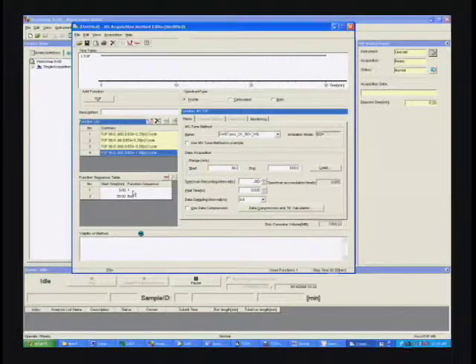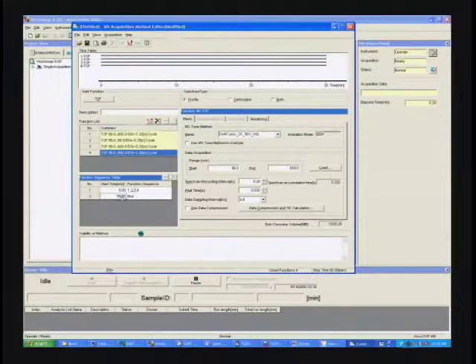Alright, the next thing we'll do is we'll set up our sequence table. We need to have it run all 4 of the functions. And we have a stop time here of 30 minutes, which would be an overall stop time, but we can stop the functions from collecting data during our acquisition whenever we're finished collecting as much data as we need for that particular file. So that's all we need to do there.